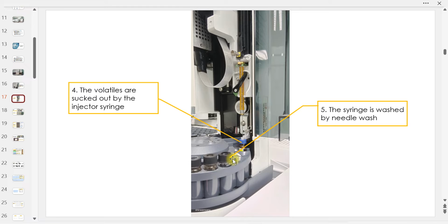Okay, sebab pernah berlaku klien kita hantar methanol punya extract. So dia dissolve dalam methanol tapi kita punya wash adalah hexane. Kita tahu in chemistry, hexane and methanol ni dia not miscible. So dia patah, bengkok syringe tu. Sebab bila dia nak wash tu, methanol tu sendiri dia macam ada friction dengan hexane. Dia tak miscible, tak boleh bercampur kan. Bengkok.